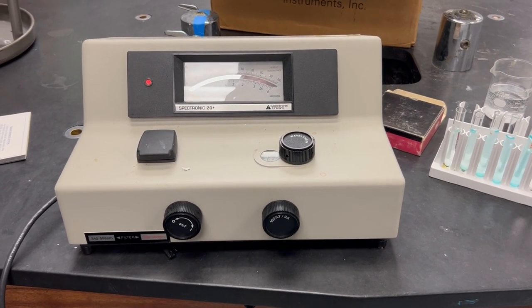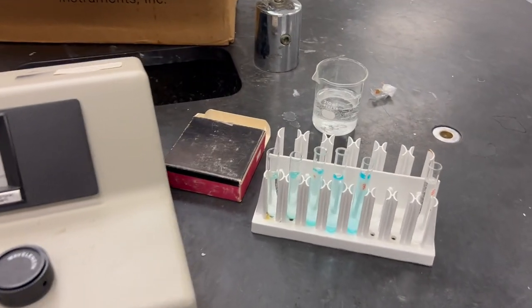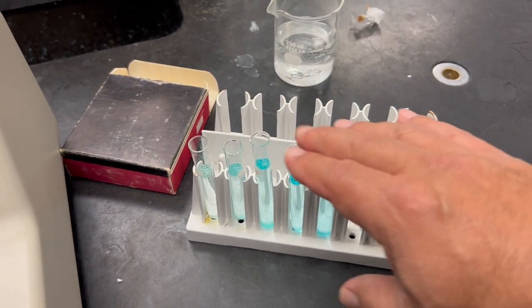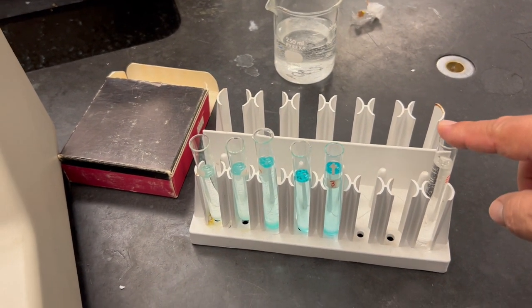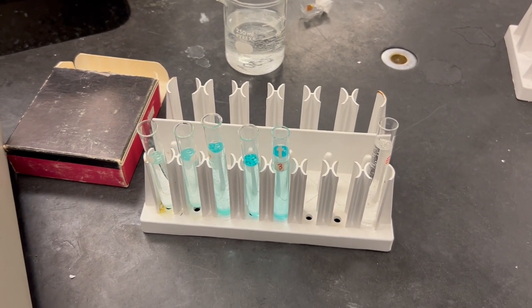This is the spectrophotometer we'll be using. Here we have some samples — five samples with solutions of different known concentrations, and this is the water blank that we're going to use to set up the machine.